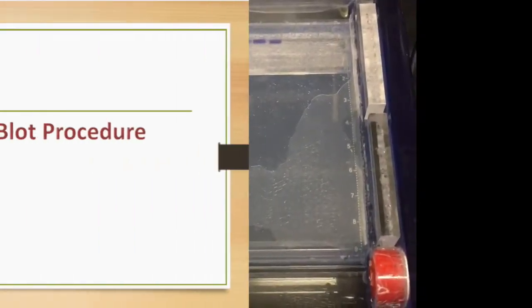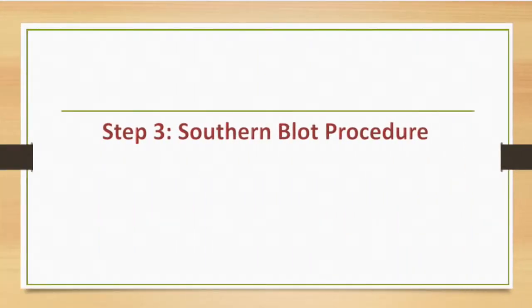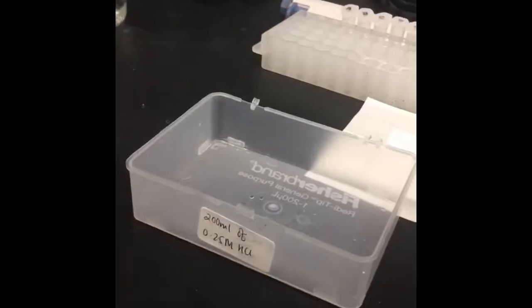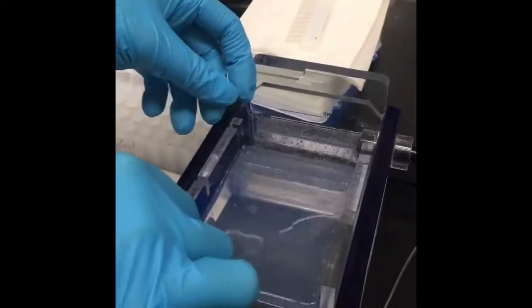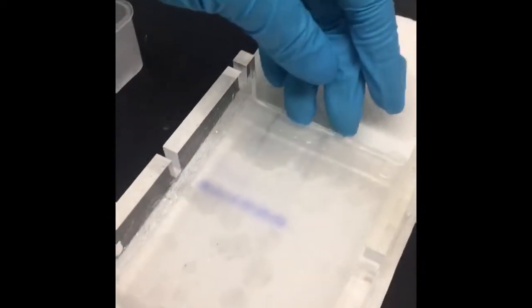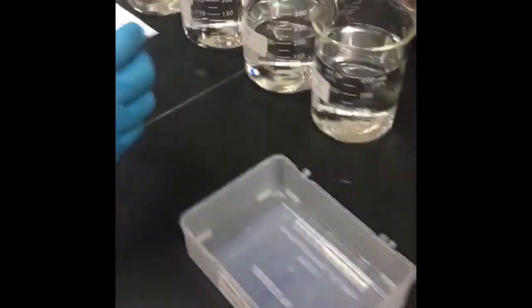And we move to step 3, which is the Southern blot procedure. In this process, we depurinate the gel by placing it in a tray containing 200 milliliters of 0.25 molar hydrochloric acid. We leave it at room temperature for about 8 minutes. As you see, the gel is taken out into a little tray and 0.25 molar HCl is poured in.